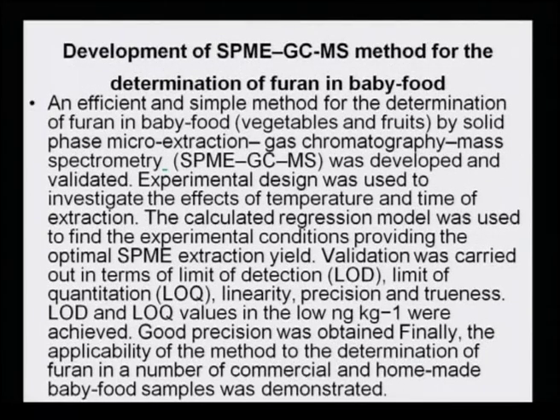Development of an SPME with GCMS method for the determination of furan in baby food. Again, GCMS, when coupled with a special extraction technique, that is solid phase microextraction SPME, makes the process more sensitive and the extraction very effective.